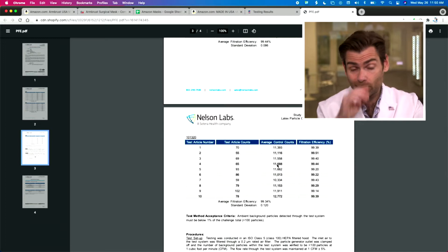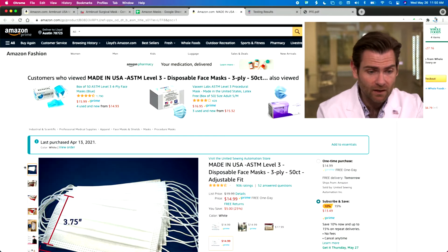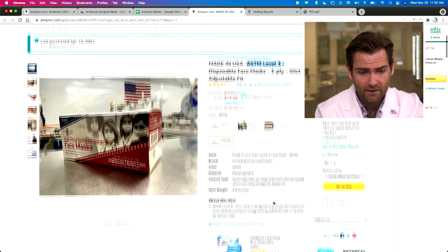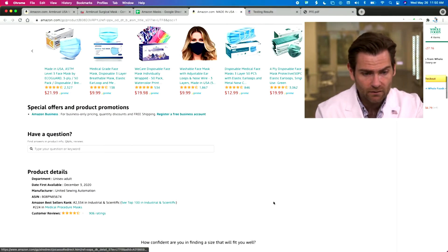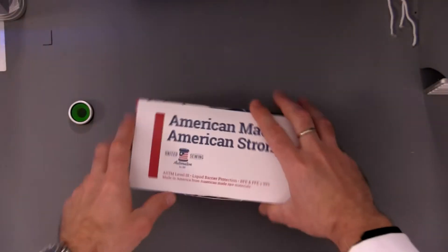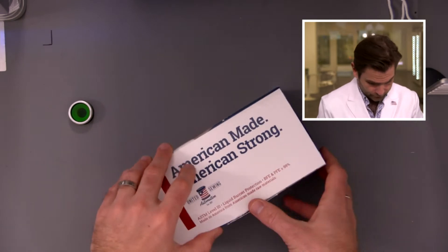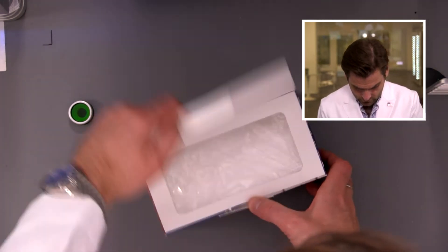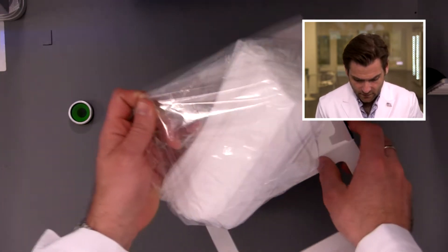So let's hope — I mean, that's exactly what this machine tests. We bought them on Amazon like we said. They're claiming ASTM level 3, so they are making that claim. Let's look at the box.